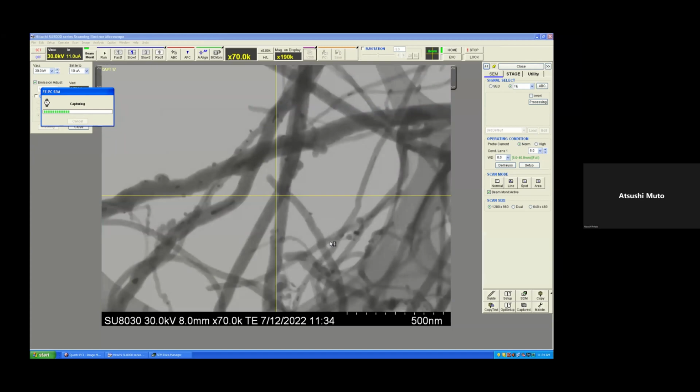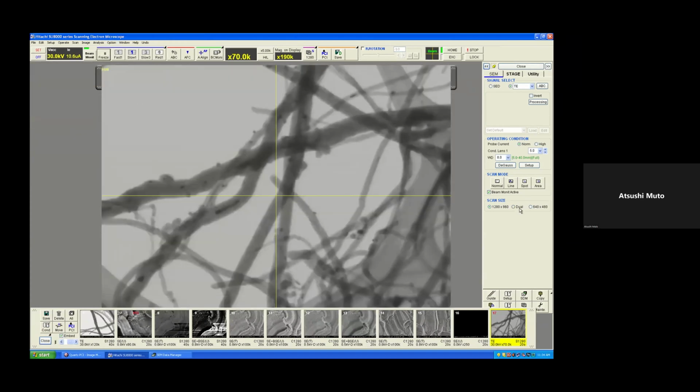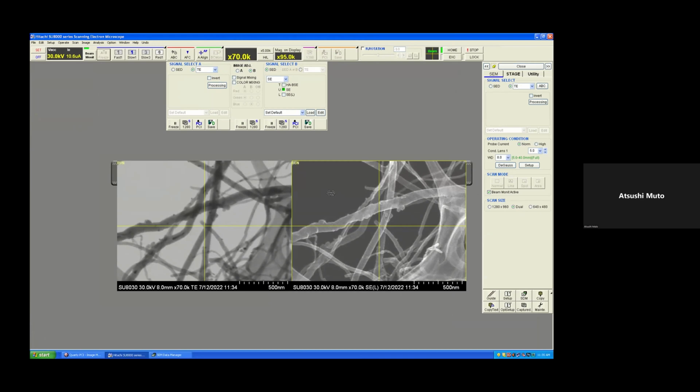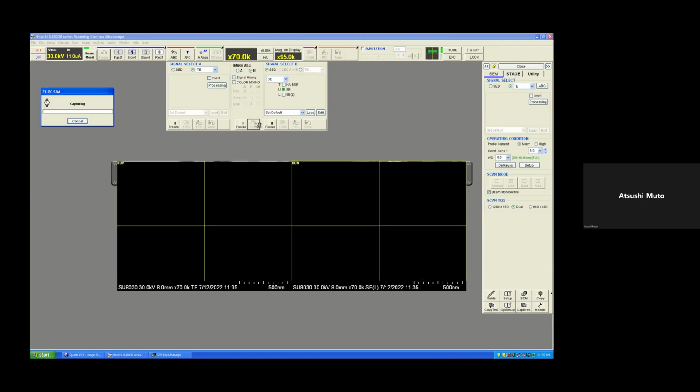If you are familiar with SEM operation, honestly it's quite easy. If you'd like to get the secondary electron and the STEM image at the same time, you can select the scan side selection box in the SEM side to dual. If you select dual, we can show two screens, and I select which signal goes in which screen. Signal selector A takes care of the left side, and signal selector B takes care of the right side. Currently I am getting the TSTEM image at the left side and the SEM image at the right side. Then we can capture both images at the same time.